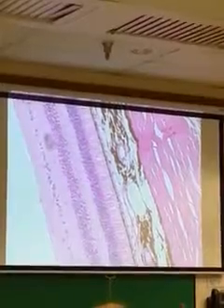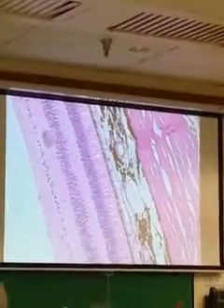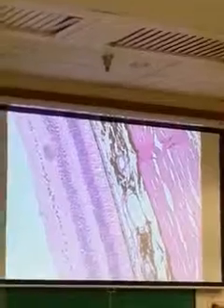And this white space in here, this is the posterior cavity, the space in the back of the eye. You should be able to go from the posterior cavity to the lens. See it? There's one. Yeah, there's the lens. The posterior cavity, going all the way back through the eye. Do the ganglion cell layers, the two pink layers on both sides of the nuclei, would you still consider that ganglion cell layer? To make it really clear, we'll just point right to the nuclei.